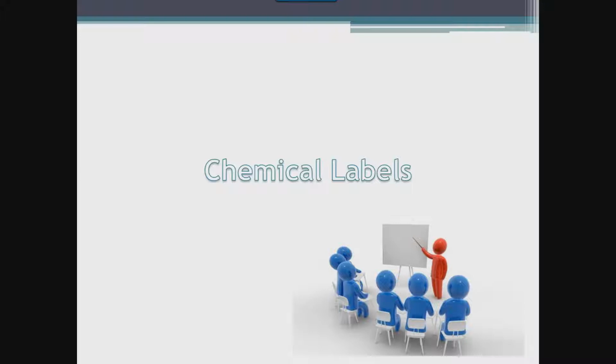This also includes any container that a chemical may be poured into if not used immediately by the same person that poured it into that container. If a chemical is placed into another container and stored, that container, that is not the original one in which it was purchased, must be labeled with all the appropriate information.